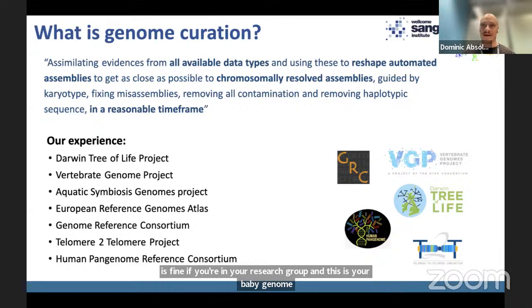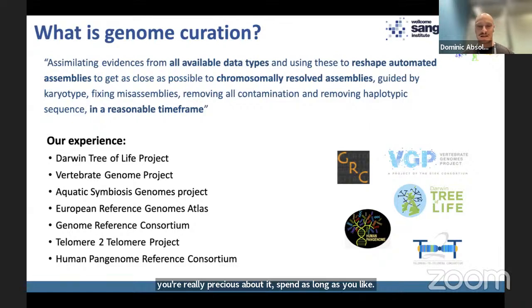For us here at Sanger in the Tree of Life project, we're trying to get through as many of these curations as quickly as possible because we're trying to hit high numbers of outputted genomes. So this reasonable time frame phrase is really important to us.